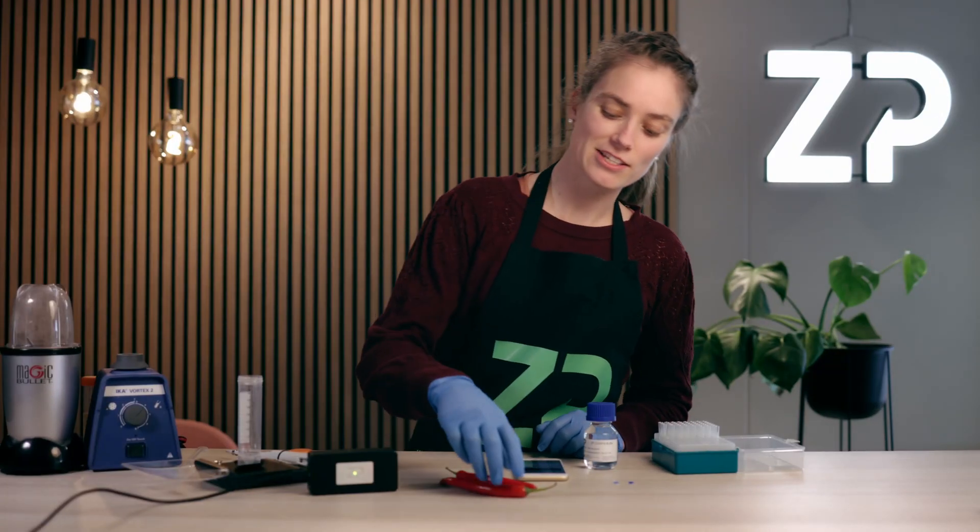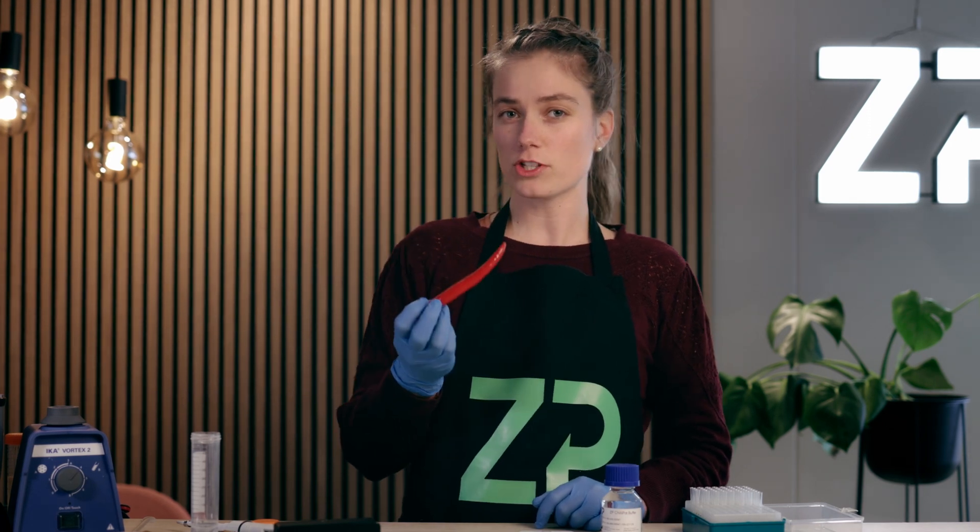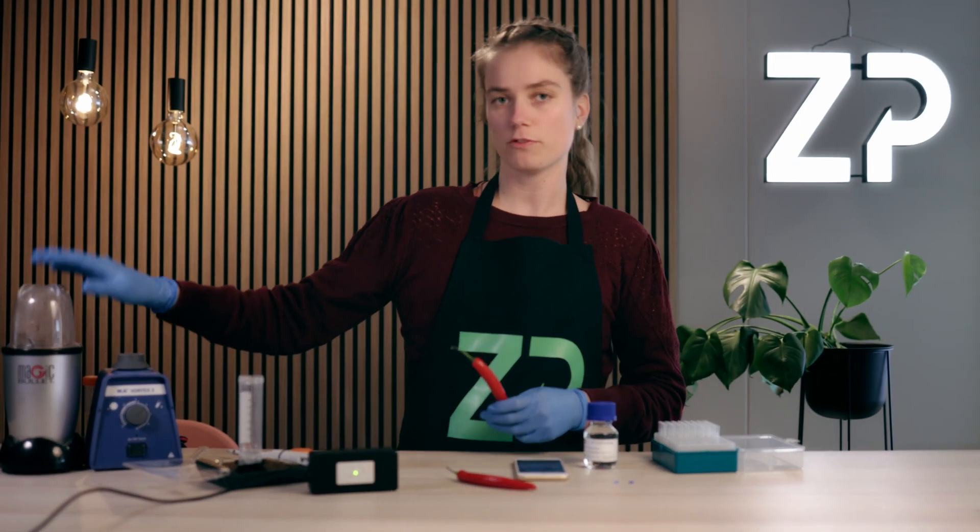The first thing we need to do is to extract the capsaicin from the raw chili. In order to do so, we'll chop it up using a food processor.